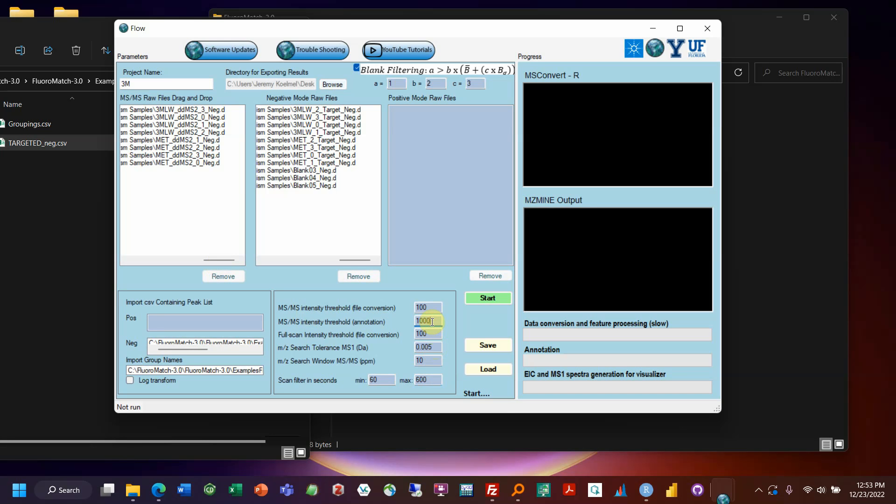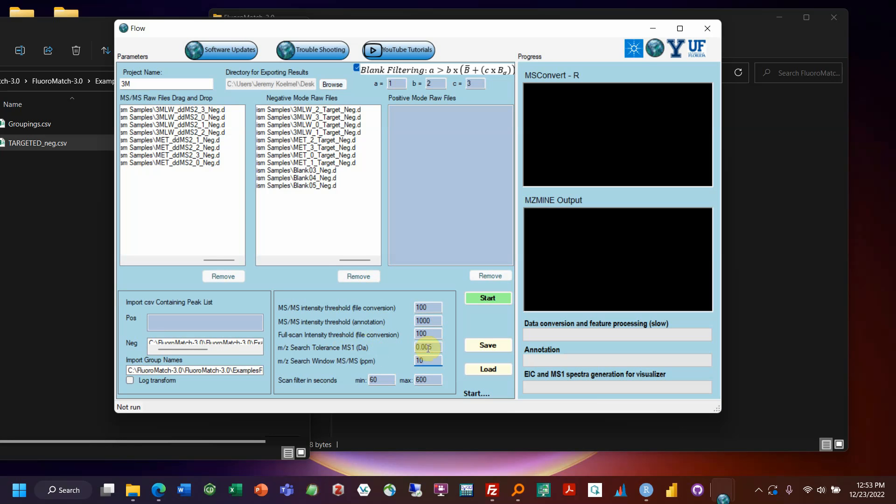So this second parameter here is just for annotation. So maybe I want to see everything above 100 intensity but I don't really want it to be used to confirm confident annotations. You know if it has something at 200 I'm not going to consider that very strong evidence. So you could have this as an increased value compared to your conversion because this is just for the identification. You'll still be able to see those MSMS peaks, they'll still be converted, it just won't use them for annotation. These are tolerances for searching. MS1 is in Daltons, MS2 is in PPM. So maybe plus or minus .005. This is a window so this would be plus or minus 5 PPM.